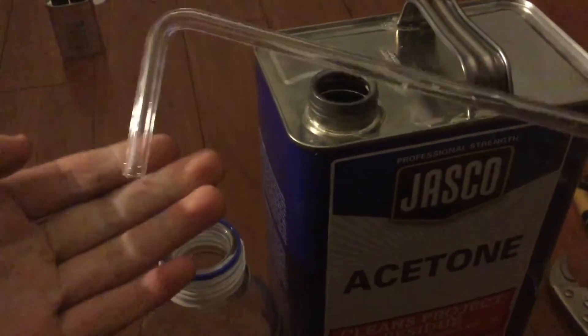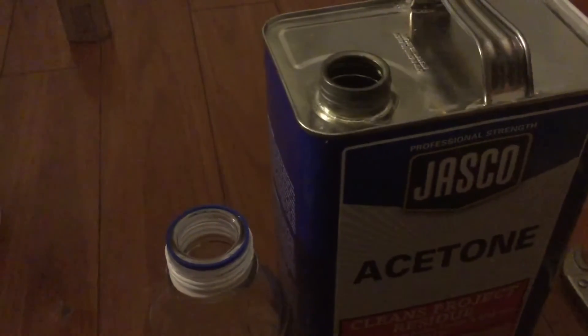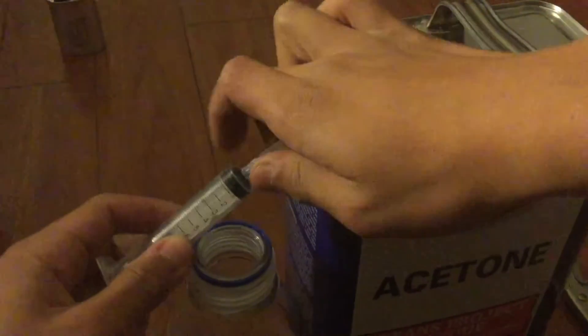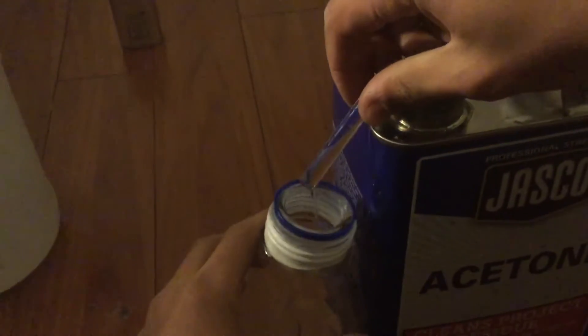Here's a bent glass tube at around 75 degrees. You simply put it in your can, and then you get a syringe or a pipette — whatever can pull negative pressure — and you simply put it on there, pull very fast, and then the liquid will start to siphon out.